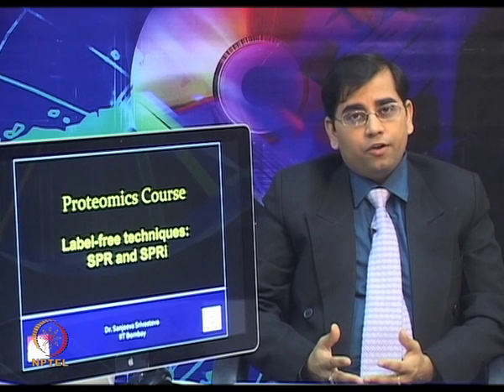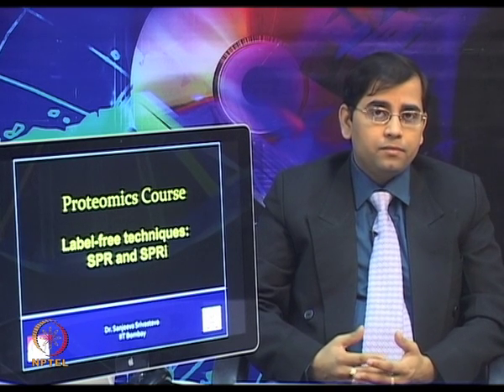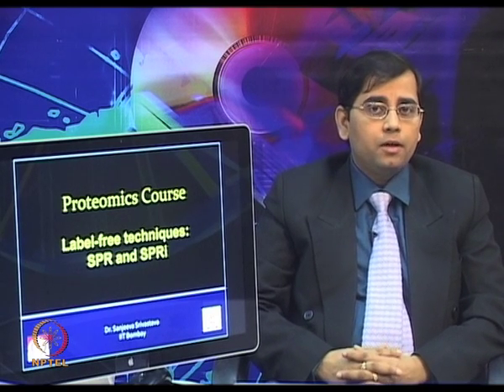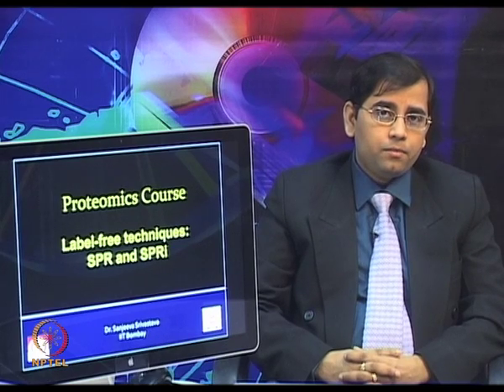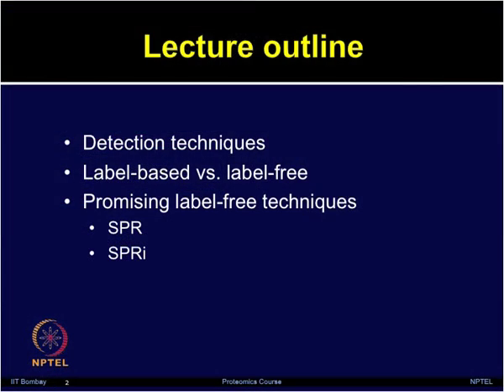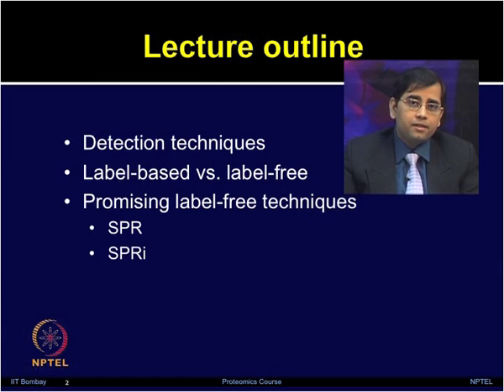But despite the promises of SPR and SPRi, there is still need for further improvement for various high throughput biological applications. So, in today's lecture, we will talk about detection techniques, the label-based and label-free. We will try to provide you a comparative vision of both label-based and label-free detection techniques. Then we will discuss some of the promising label-free techniques such as SPR and SPRi.